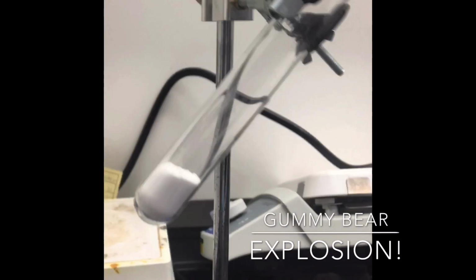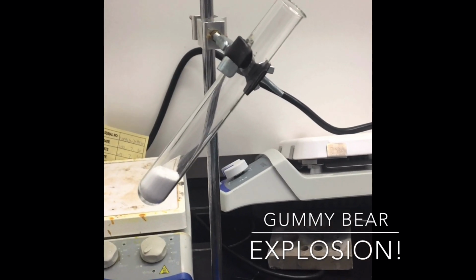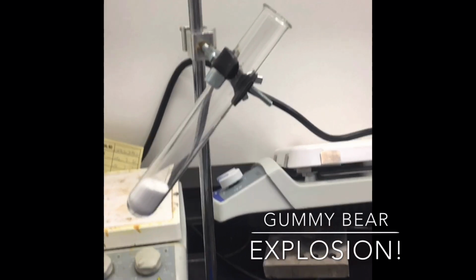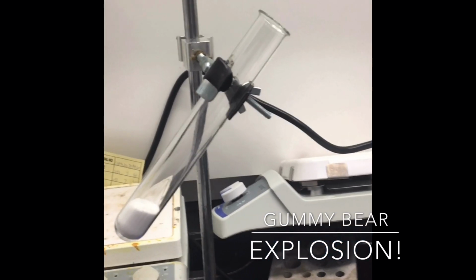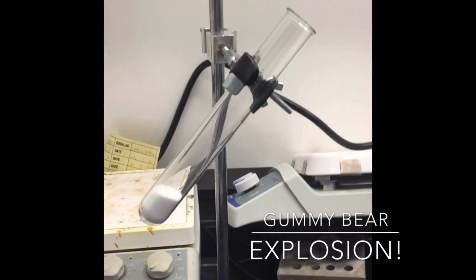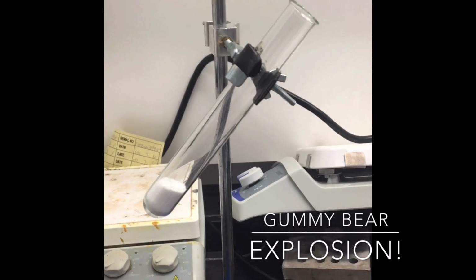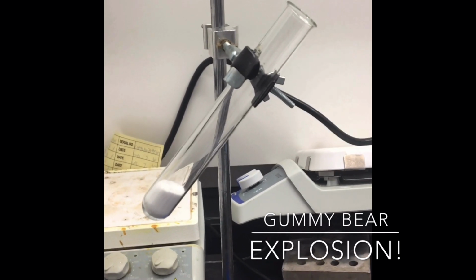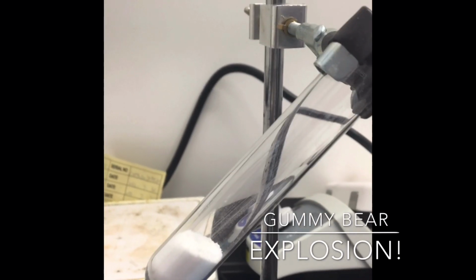Okay, so now we're going to do an experiment that you have probably heard before, the gummy bear explosion. What we're gonna do to this poor gummy bear, and I chose the green one, is see what happens when we mix it with a compound called potassium chlorate. This potassium chlorate has, of course, potassium, it has chlorine, and it has oxygen. Potassium chlorate is a white powder.